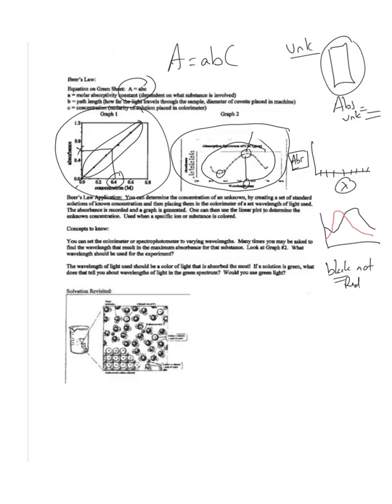I want to know the copper, but I don't want to know the cobalt. So I would want to pick a wavelength of light where I maximize the one sample, but I minimize the other sample. That would be the light I want to use, because then the red substance, let's say it's cobalt, will not interfere in the absorbance of the black line, which is the copper. Okay, let's say this is cobalt and this is copper. So when you see this graph, you might be asked what wavelength light the student should utilize in their experiment.